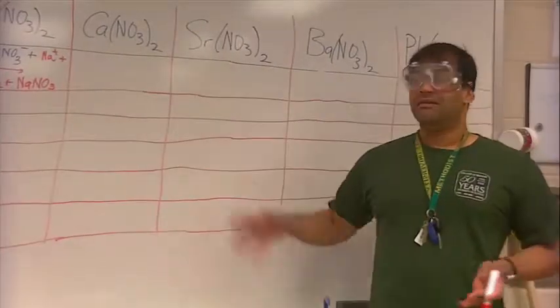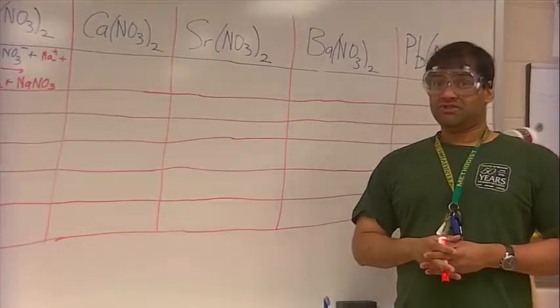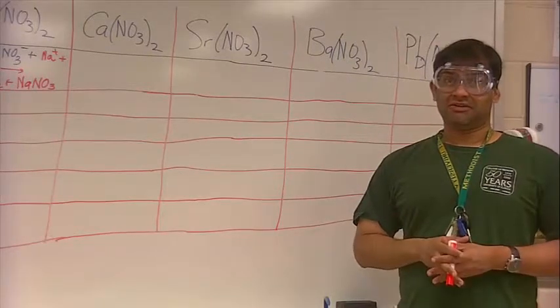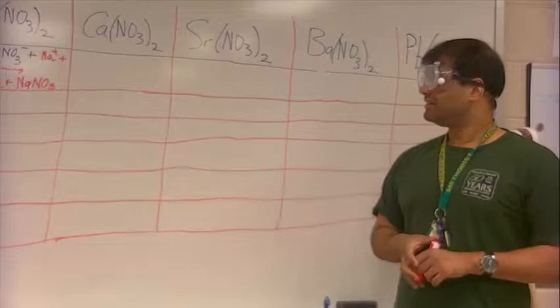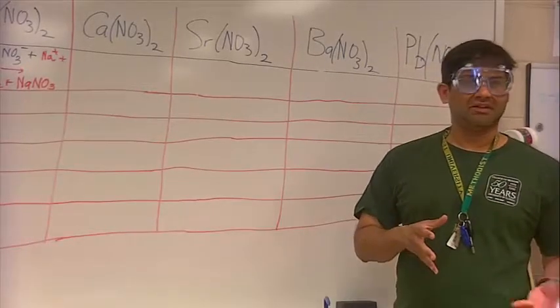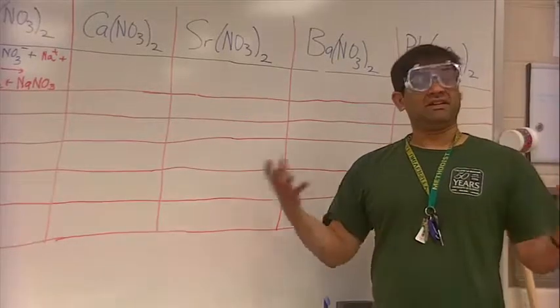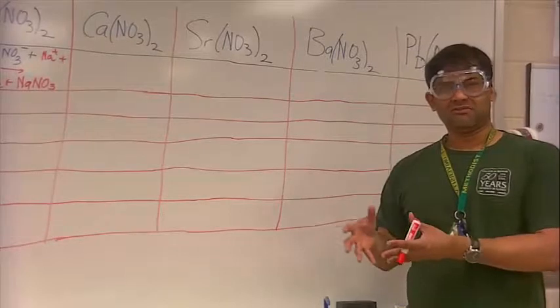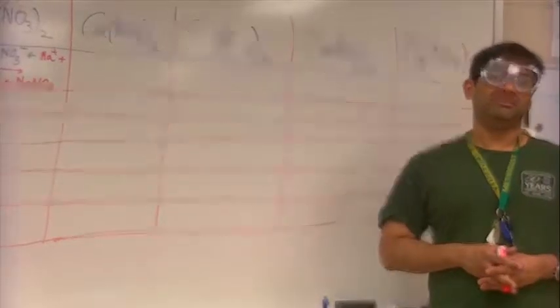Once again, be very descriptive in what you see when you react these chemicals, these aqueous solutions together. Be very observant on the amount of precipitate that forms. Is it slightly soluble? Is it completely, totally a precipitate that is cloudy? Is it turbid? So write down all that you see.